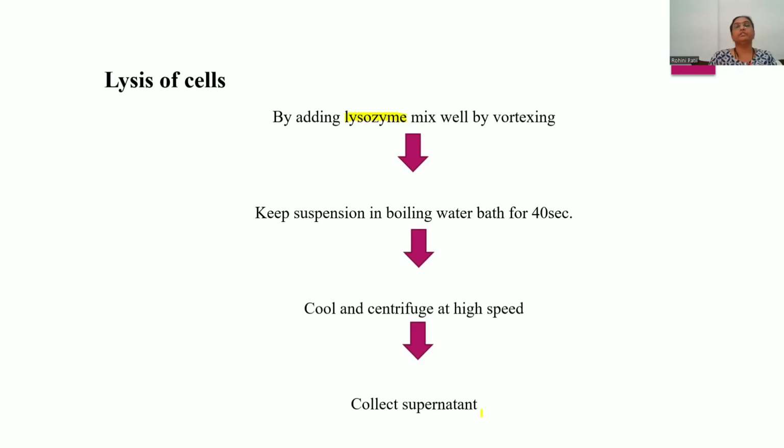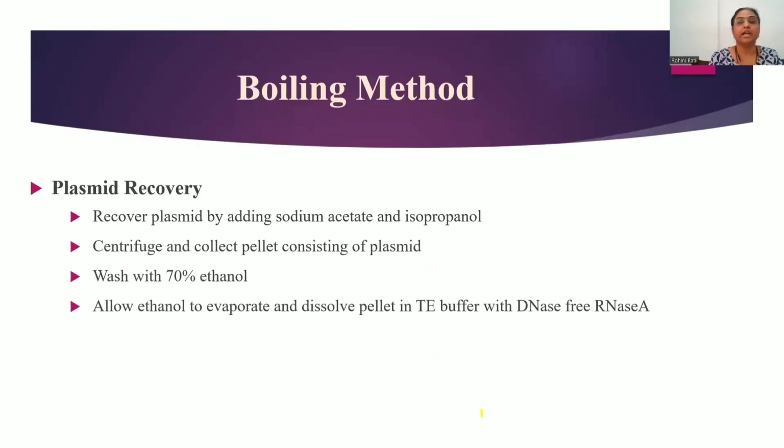In the supernatant, there will be the presence of the plasmids, and those plasmids can be recovered by adding sodium acetate and isopropanol.